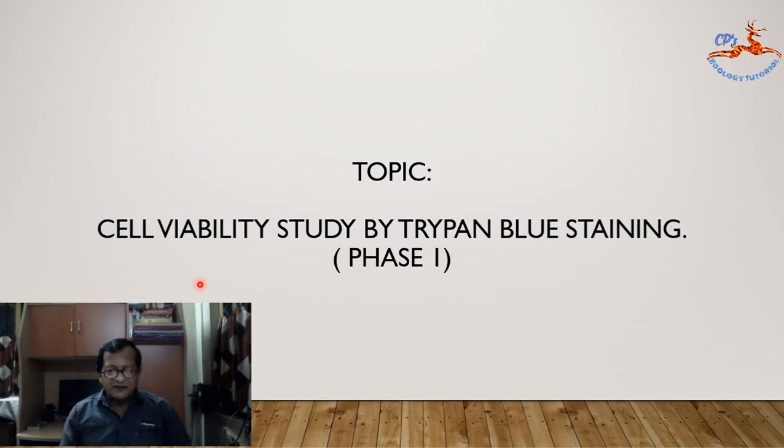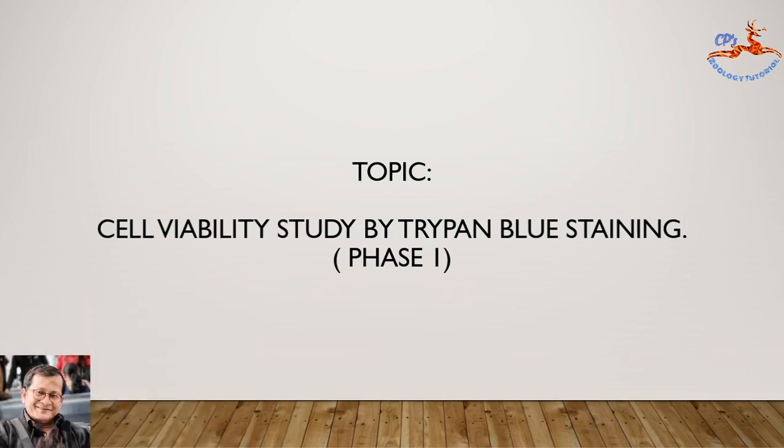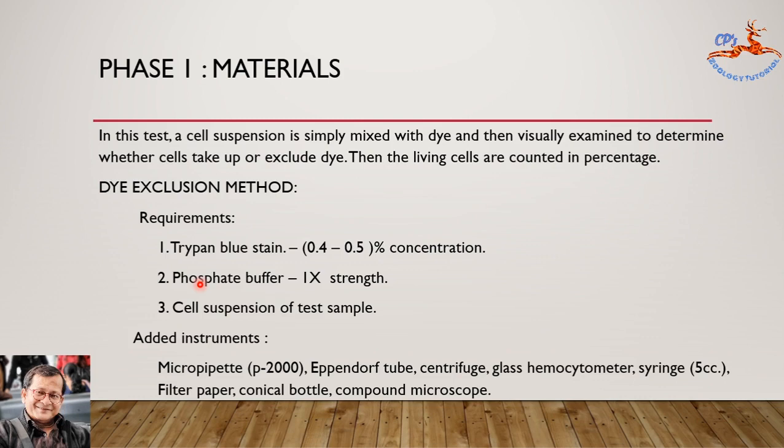In the first phase, I will go through the materials to be used and how to prepare them. In the second phase, I will go through the application and the result of the test. Okay, now let us go into the first phase. This is the material we will use.